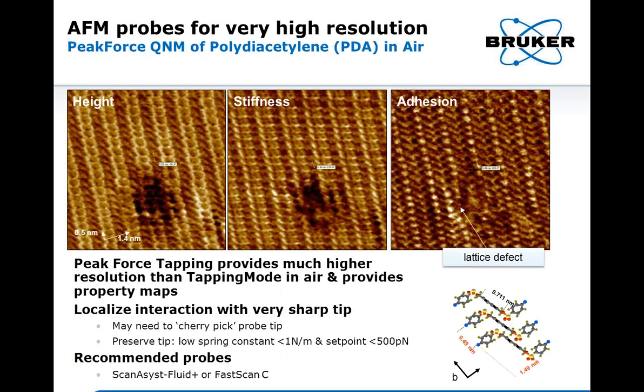Next, we're going to look at some high-resolution imaging in air. In this application, we're looking at a high-resolution image of PDA in air. The adhesive forces in air are generally too high to achieve this resolution with tapping mode. So, in this case, we're using Bruker's PeakForce tapping mode to achieve this high resolution in air. PeakForce tapping does not depend on the amplitude and is therefore capable of high-resolution imaging in air.